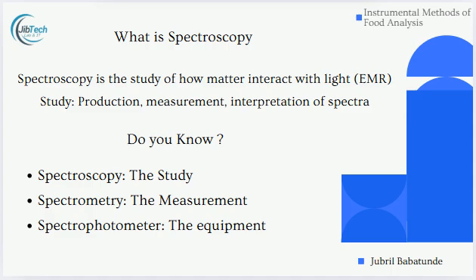You can pass a source of light through that cup, and the juice absorbs some of the light, and then some other part of the light goes out of the cup, and then you measure the intensity of light absorbed, and you can deduce the concentration of vitamin C in the juice that is located in the cup.